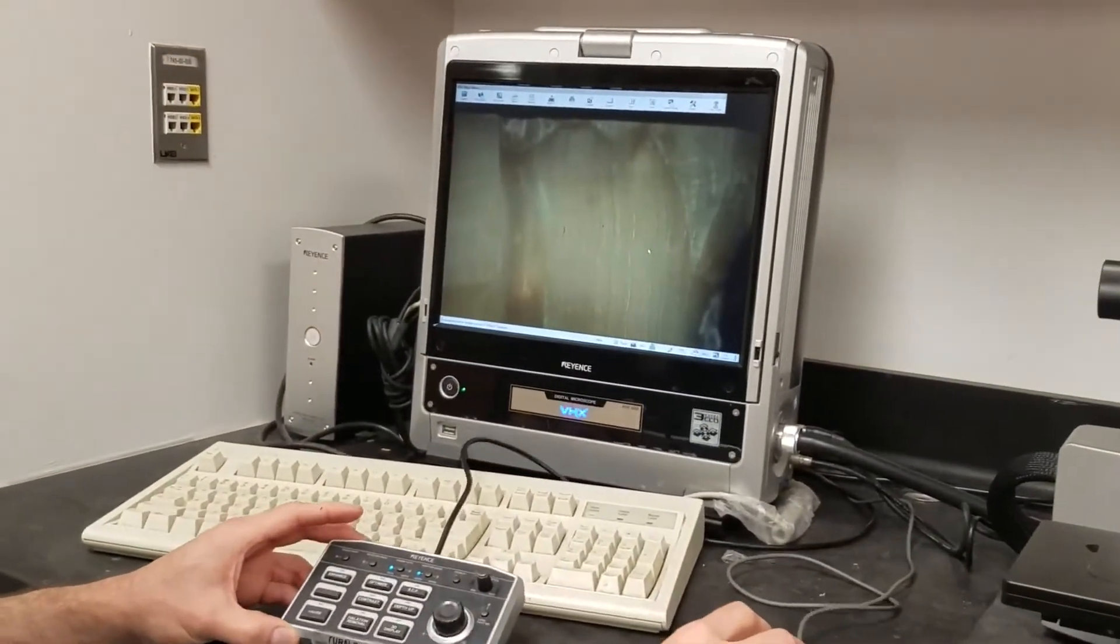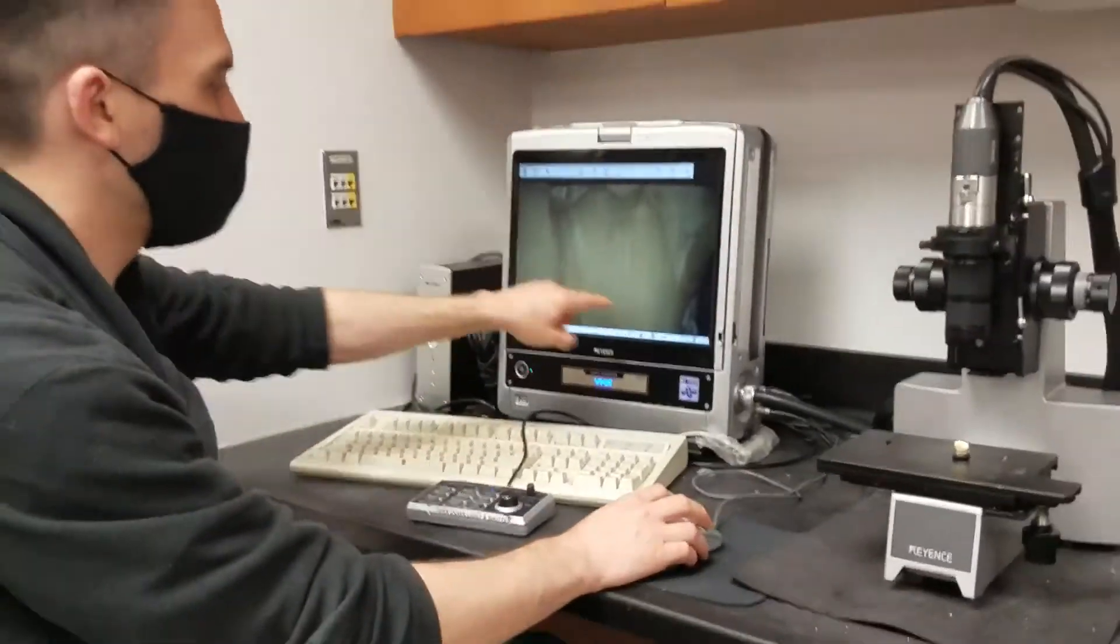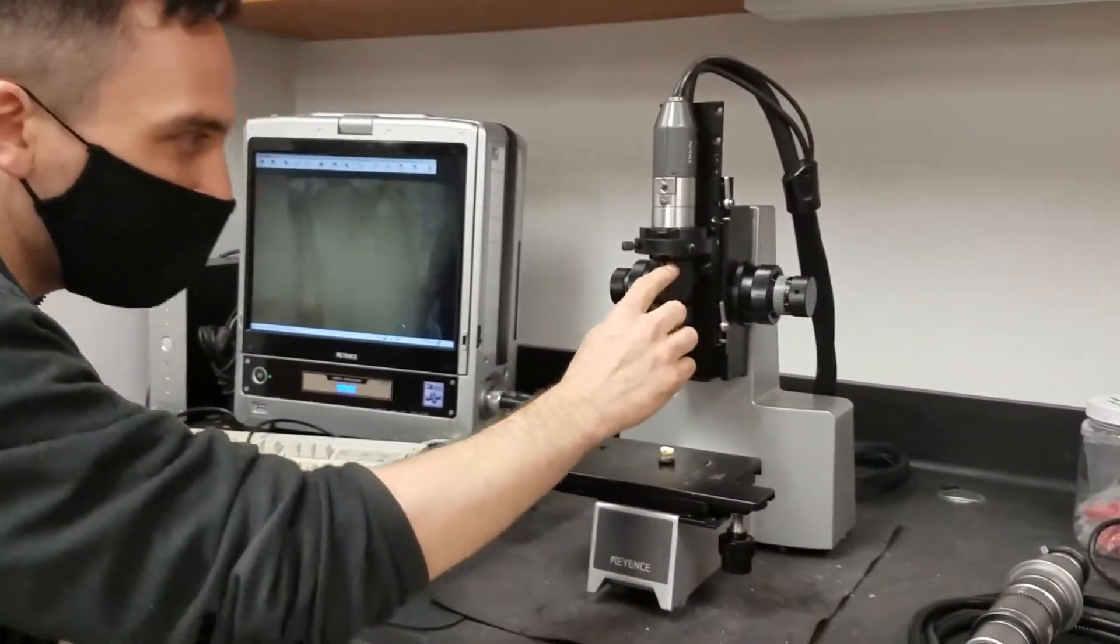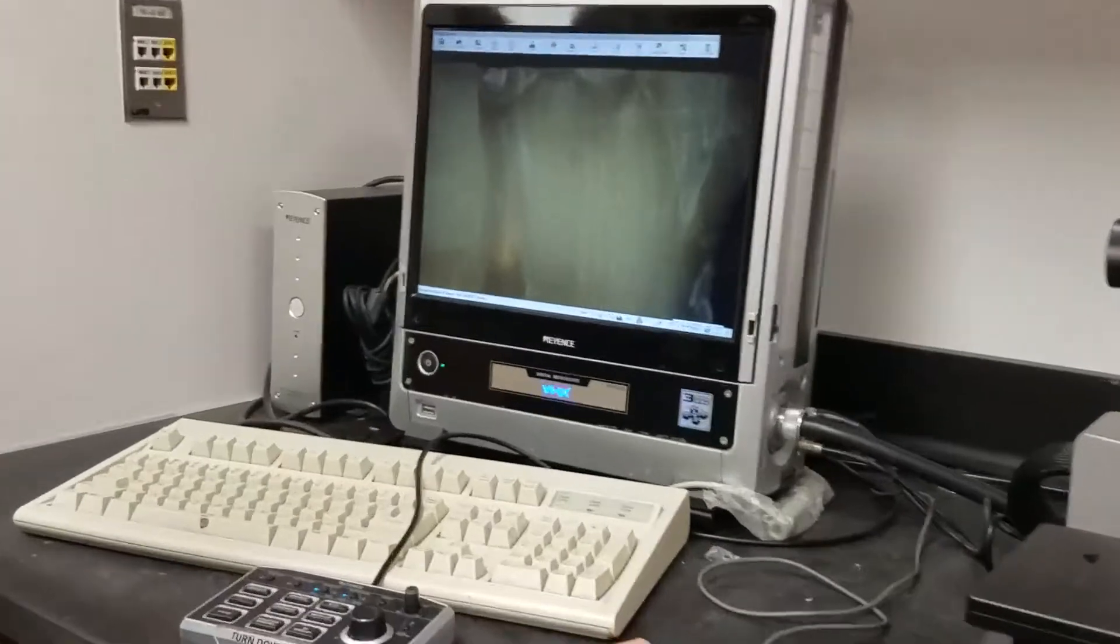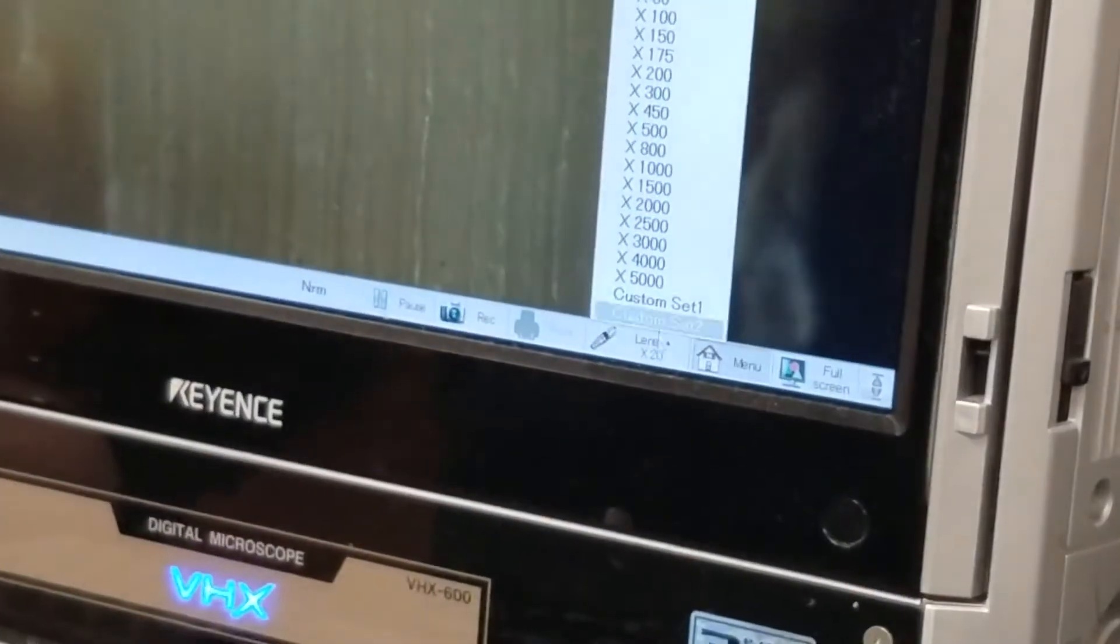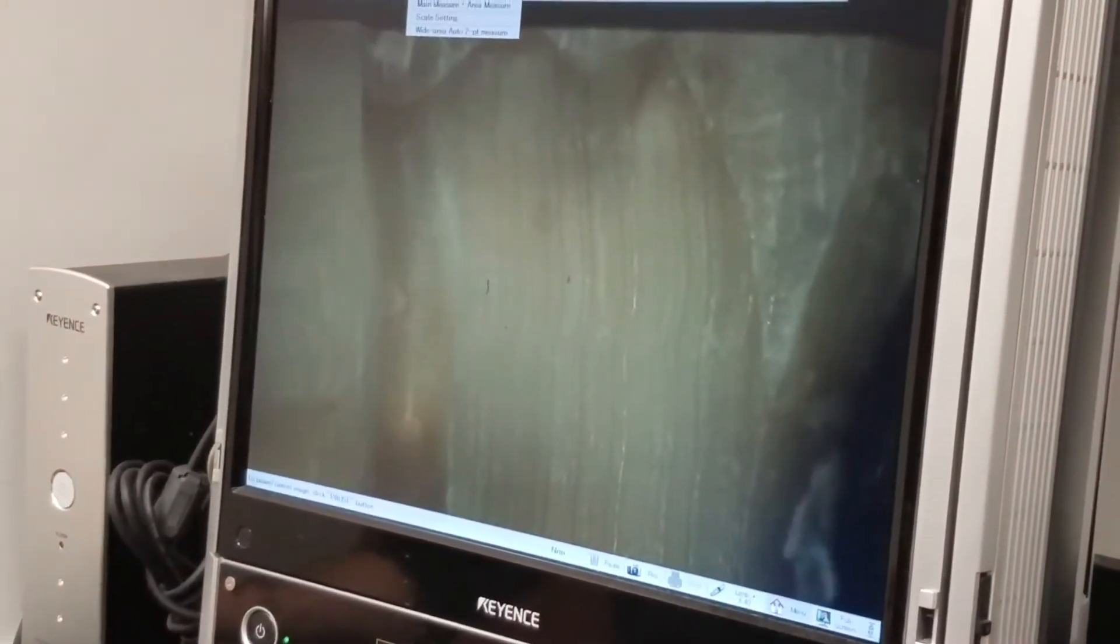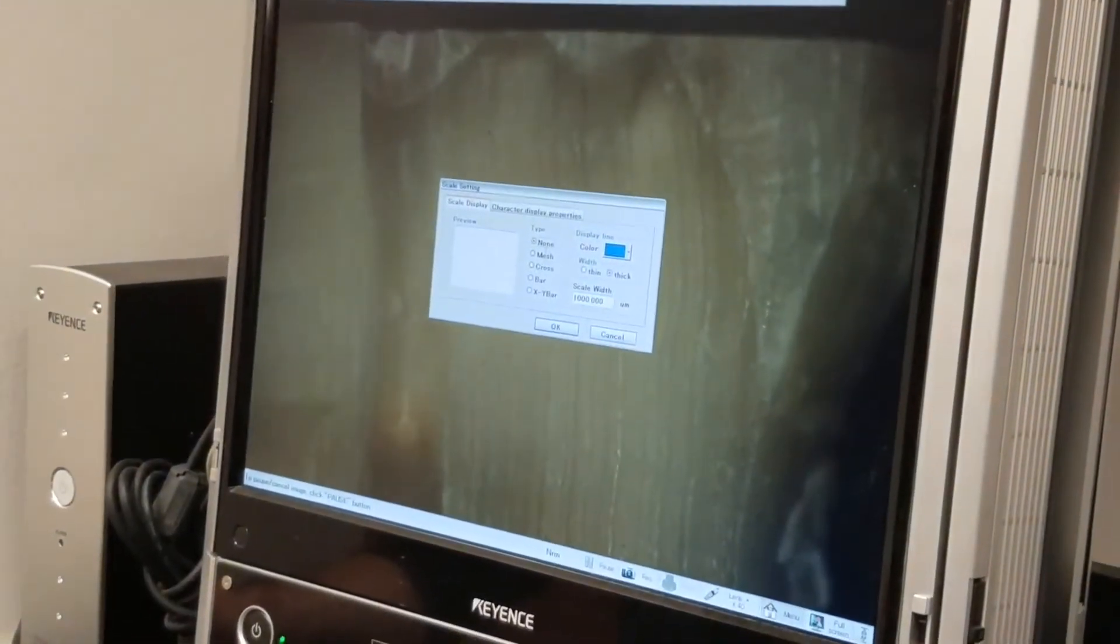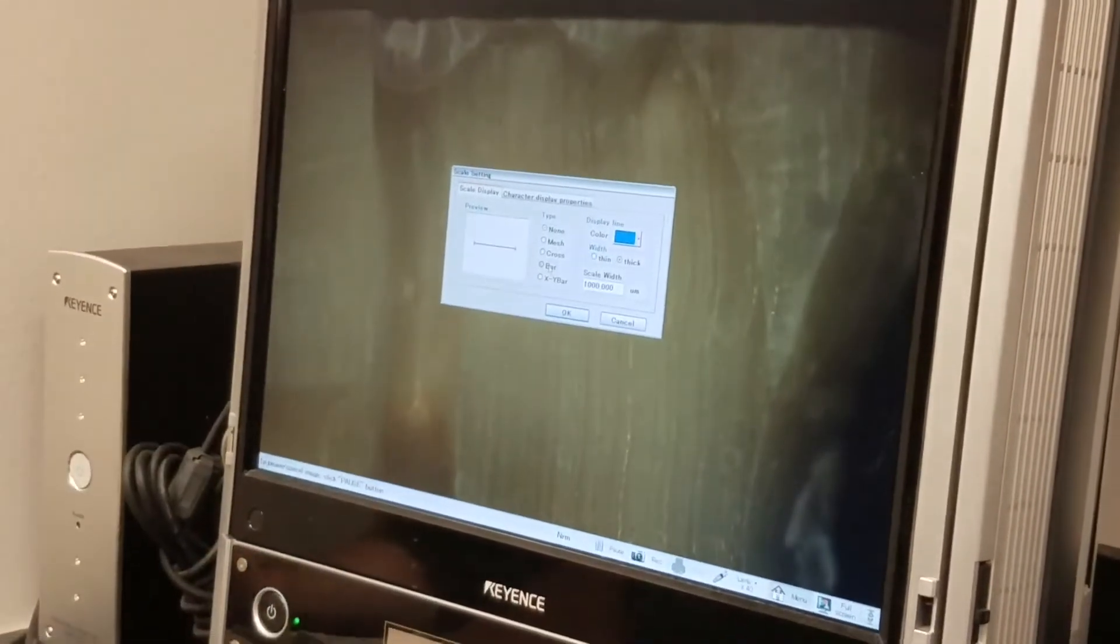The other thing I can do is I can put a scale bar on here. If I want to put a scale bar, I've got to see what magnification. So right now I'm on 40 magnification. I go over to this button down here that says lens and I find 40 magnification and I select that. And if I want to put a scale bar on here, I can go up to this measure tool. I go to scale setting. I usually want my scales to be a bar.